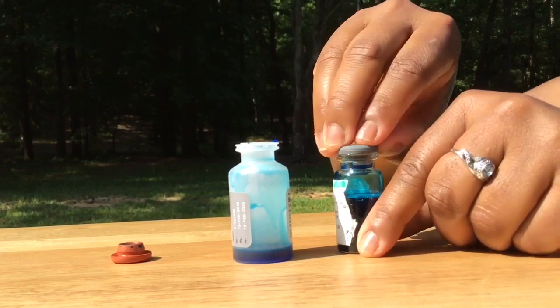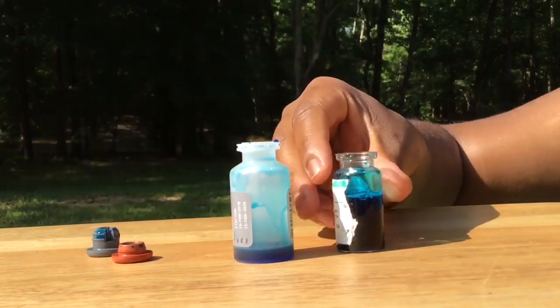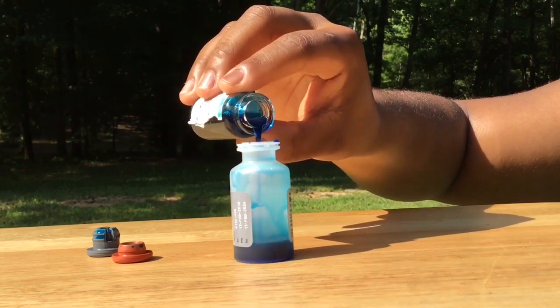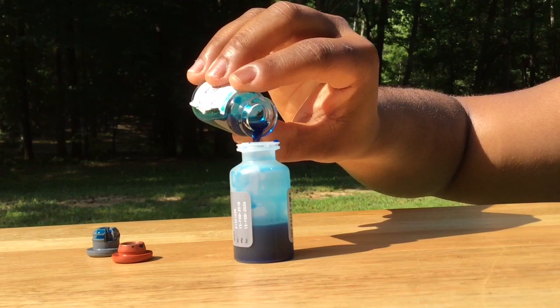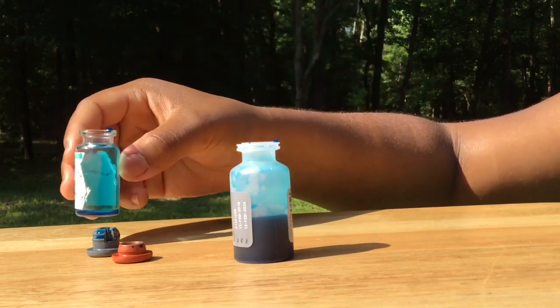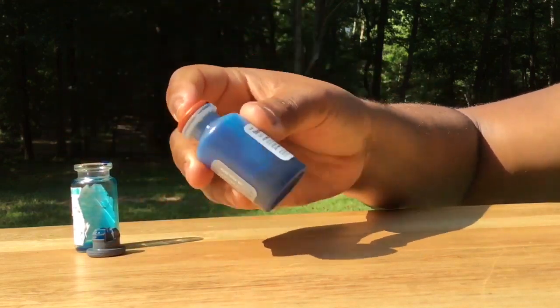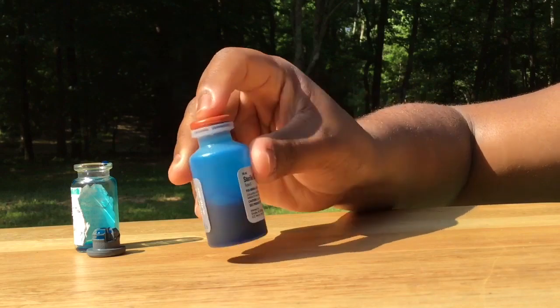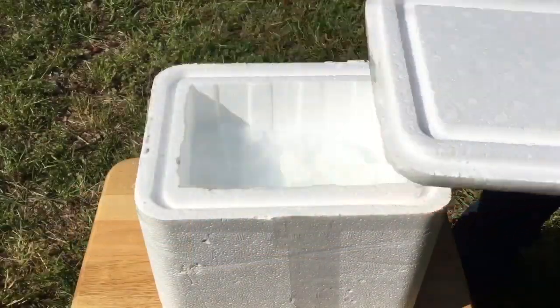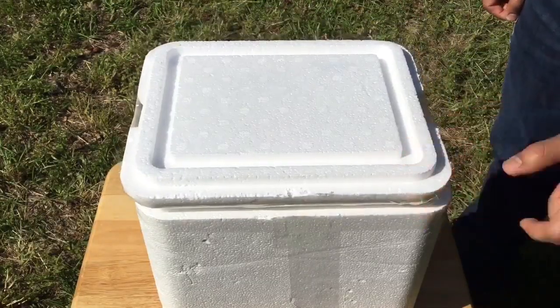Then, take the lid off the vaccine bottle and pour the contents back into the diluent bottle. Put the lid back on and shake briefly. After mixing your vaccine, place it on ice and keep it cool between each bird that you vaccinate.